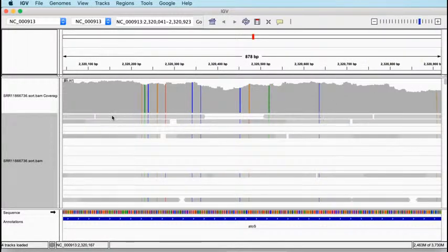So now here on this top row, we can see a pair of reads. We've got the left-hand read, which has a little arrow and is pointing towards the right-hand read, which again has a little arrow and is pointing towards its pair, and they're joined up with a little line. So this is illustrating that these two reads are a pair of reads.